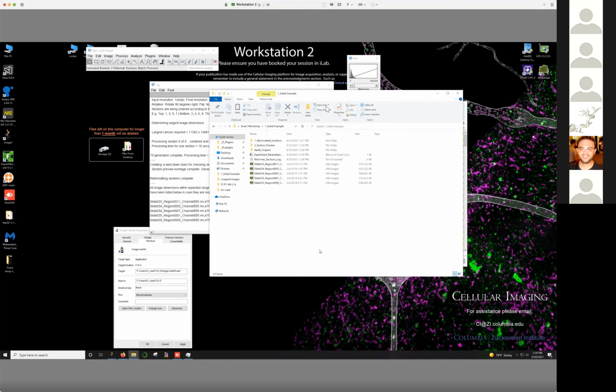If you're using the new pipelines from the slide scanner, where we also give an image of the pre-scan as well as the raw tissue sections, you want to take that pre-scan image out, because it's going to be confusing for the pipeline to have pre-scan images as well as the individual sections. I think I've written the pipeline now so it will give an error if there's data like that. It'll just stop and tell you that something like that is happening.